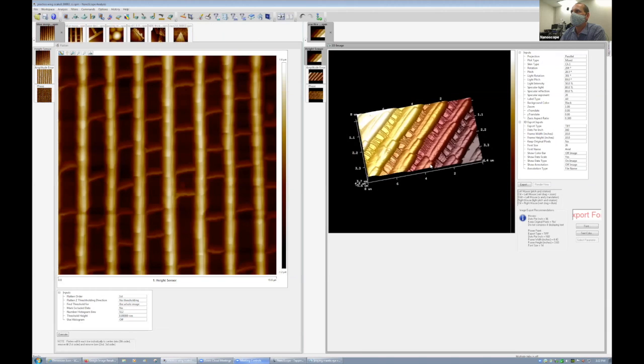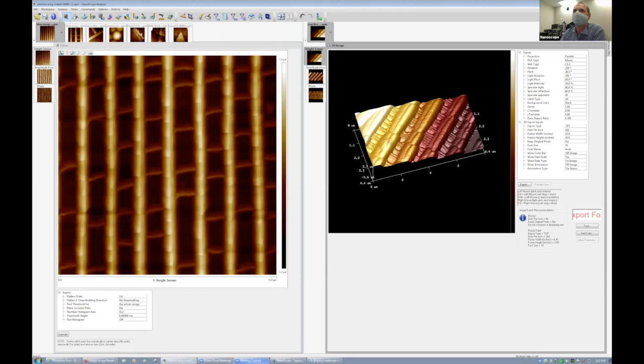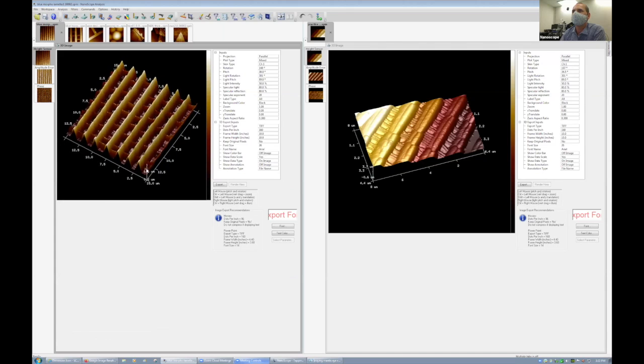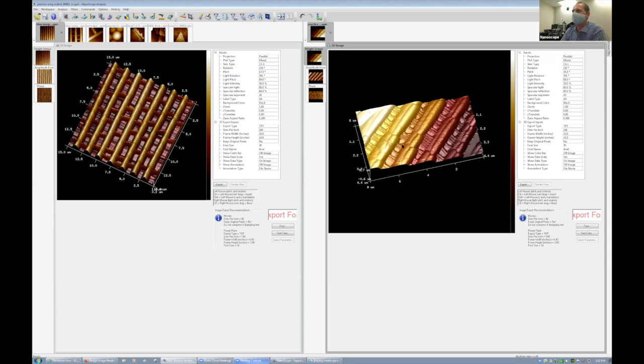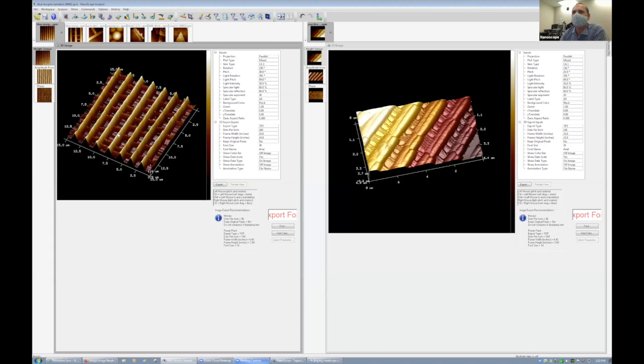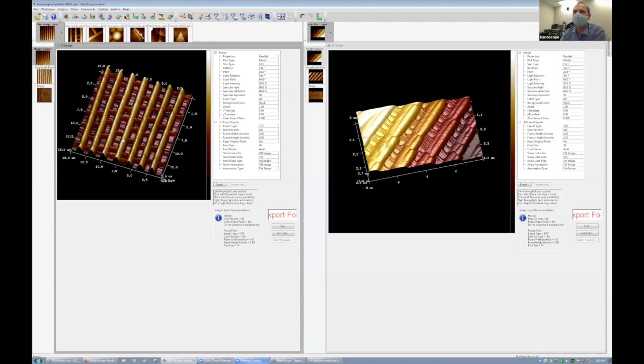Yeah, so you can see the one on the left is the blue Morpho, and the one on the right is that practice wing that Marcin was talking about. I thought that was really interesting. The practice wing has a lot of little connections, but a completely different large-scale structure of the ribs. Blue Morpho has very fine, very sharp ribs and a very regular structure, like a ladder of those connections in between.